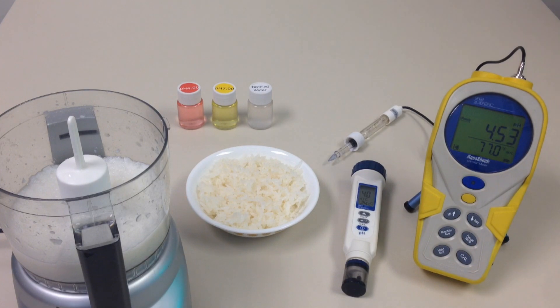Today we are going to demonstrate two different ways that you can check the pH of your sushi rice.